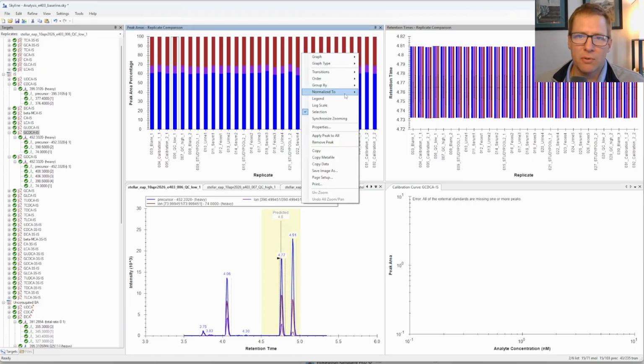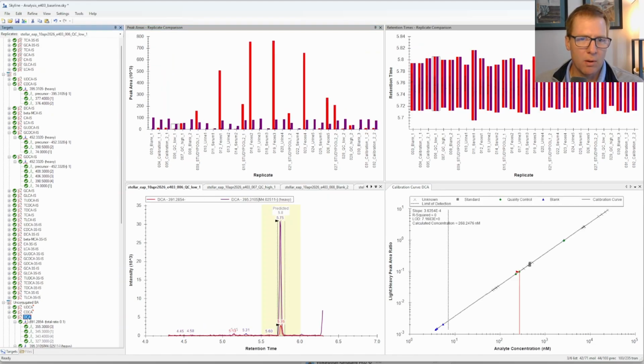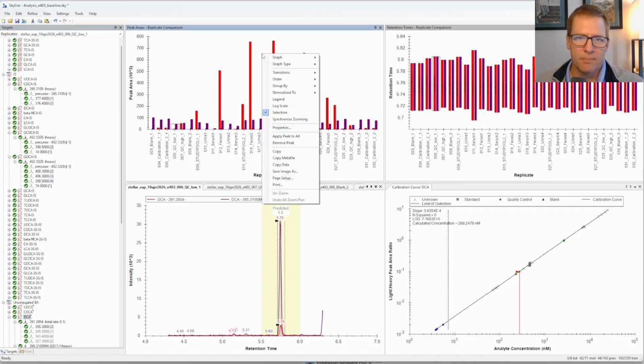I'm going to go back to the main view to show this last one. Okay, so the last tip is to group these molecules. You'll notice that in this case we ran a calibration series, some QCs at the beginning and end, and we ran pools throughout. If we go down to one of our molecules that is being quantified, one of the things that makes it easier to see if things look reproducible is sort of 2 steps.